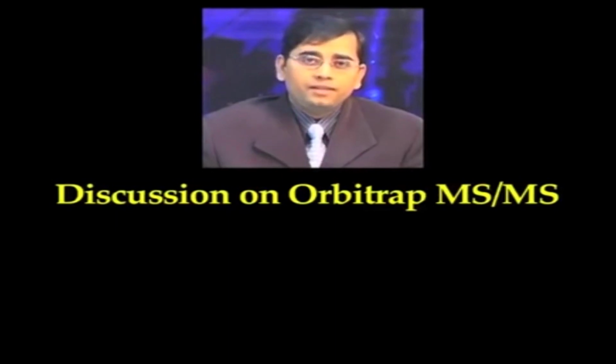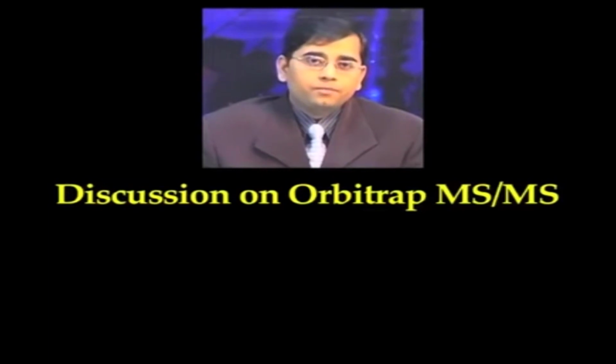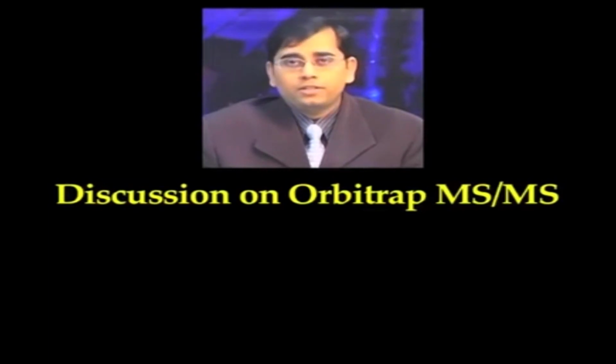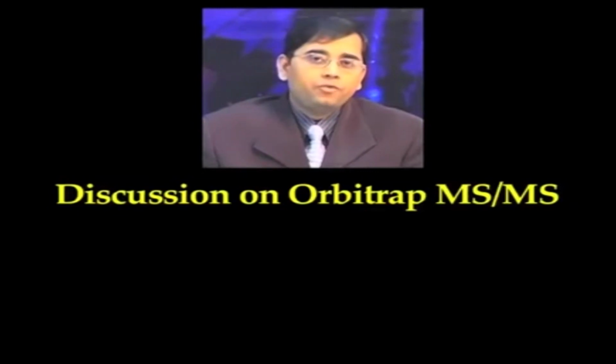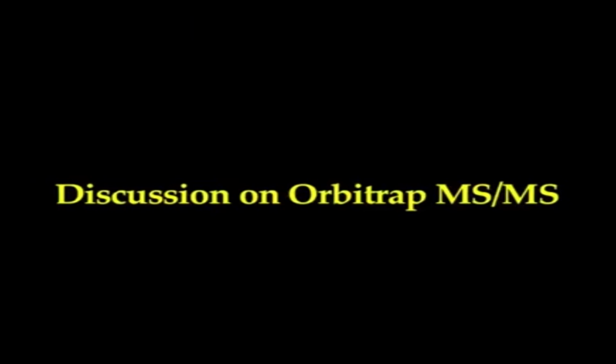So, I have invited one of the application experts from Thermo Fisher to discuss what the Orbitrap technology is, its principle, and how it can be applied for different types of applications. So, I will have a discussion with Mr. Sangram Patnaik from Thermo Fisher.